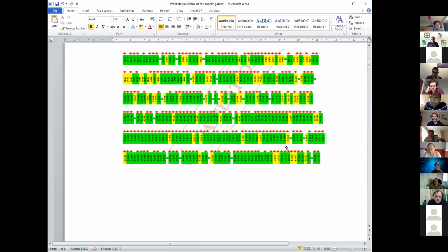Otherwise, I cannot explain. I cannot believe that this guy who was doing the fitting was saying that his assessment graphs are, for some reason, quite amazingly good. But how can they not fit to the EM densities? It's a mathematical issue. It's a problem of the wrong origin. It has to be somehow fixed and checked.